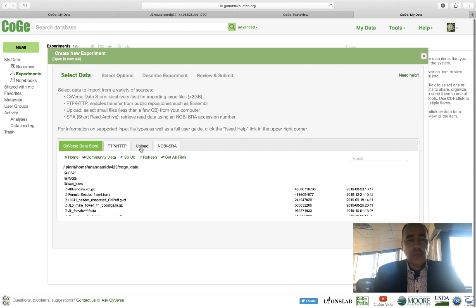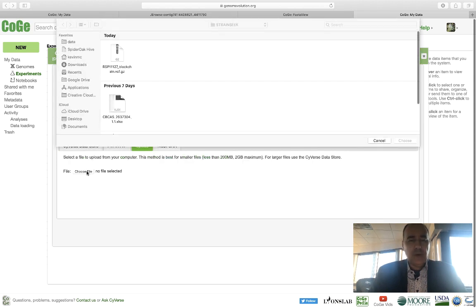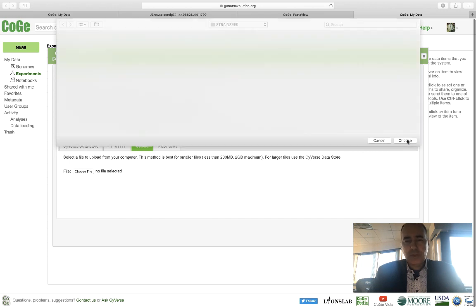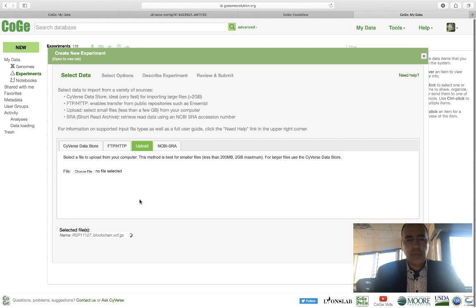and this should bring up a window that allows us to load up a file. So we're going to hit the upload button here. We're going to choose a file, and you want to pick your VCF file. There's one right there. Now these can be a little big sometimes, so let's just see how well it soaks this up. We're in that range right now, and once this realizes this is the VCF file, you hit Next, fill out some meta information.